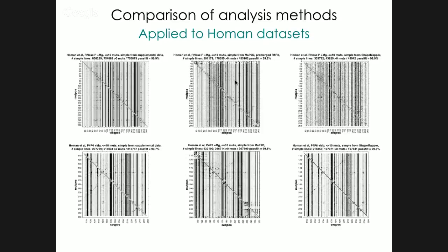I think what's more important to track down is the bottom row. I guess it's the discrepancy between the data from the map2D versus shape mapper and the simple file that suggests that my way of analyzing using just one fastq might be faulty. There might be a bug.